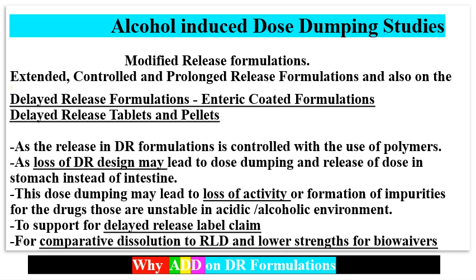That means the delayed release target may be hampered due to the presence of alcohol in the GI tract. This dose dumping may lead to loss of activity or formation of impurities for drugs that are unstable in acidic or alcoholic environments.